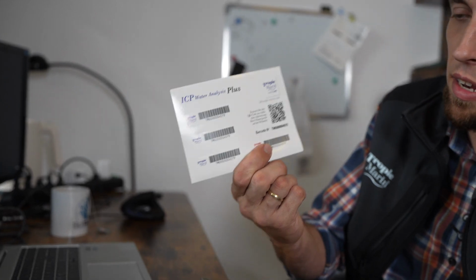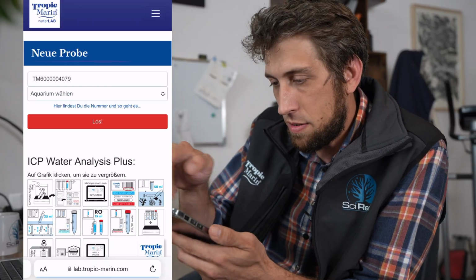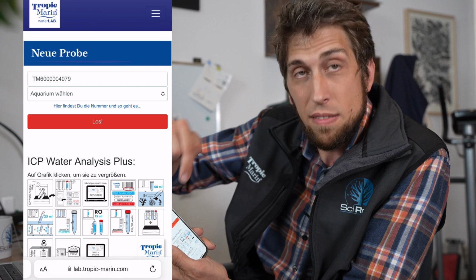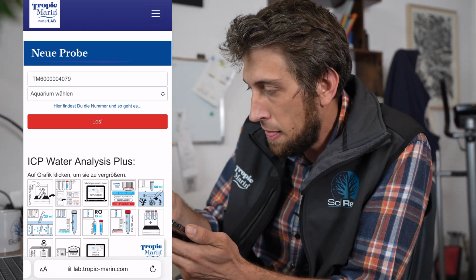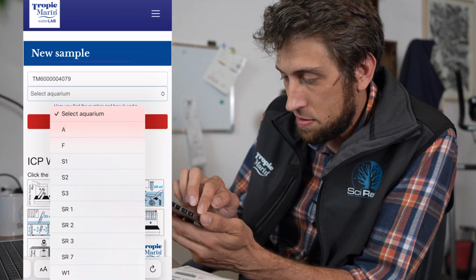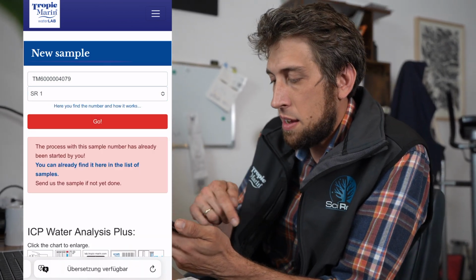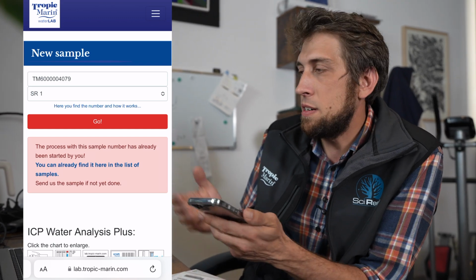One feature that is really convenient, both for the ICP Plus and the normal ICP, is the QR code on the sheet here, with which you can directly link this sample to your tank. I just tried it for the first time and it's super easy. You just scan it and go to the link. If your data are already saved and you're already logged in, the number is already on the screen, so you don't have to type it in. I just switched that to English because it's the English video. We select the aquarium, in this case SR1, go, and now we get a notification that it has already been started. Of course, it has already been started because we already connected it. But generally, super easy, super convenient.